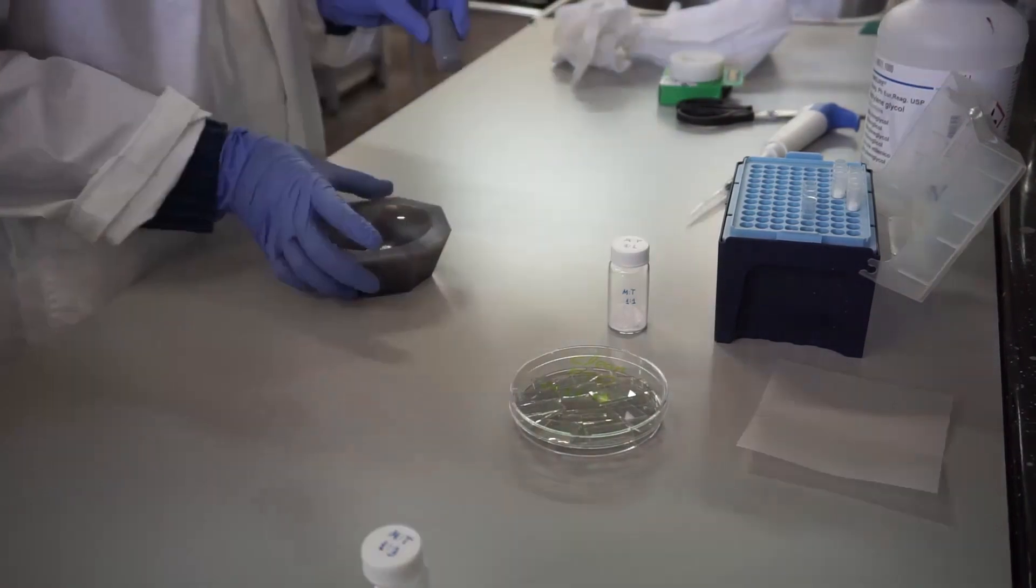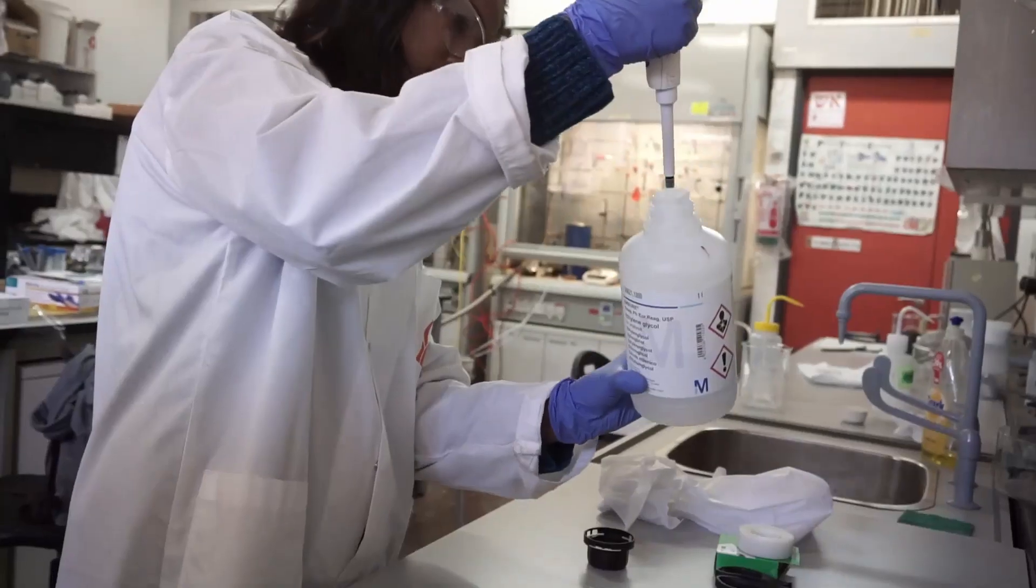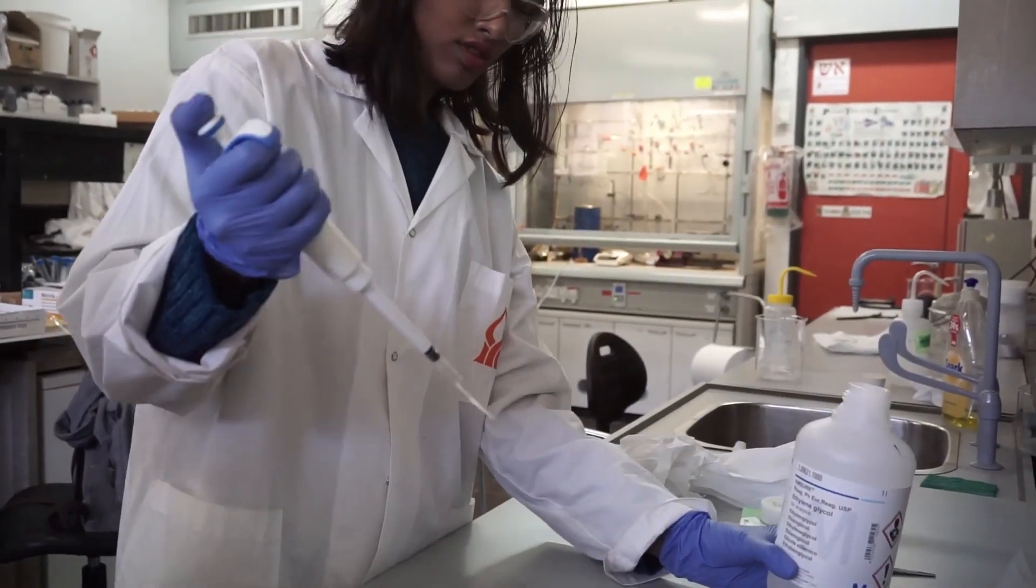Dr. Blade is a common and straightforward method to spread a thin layer of paste on any substrate of interest.